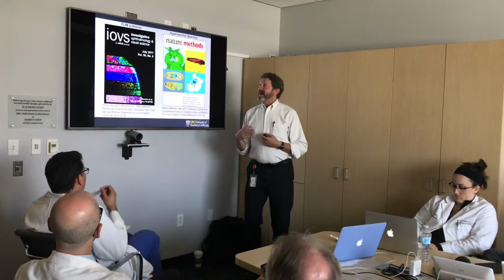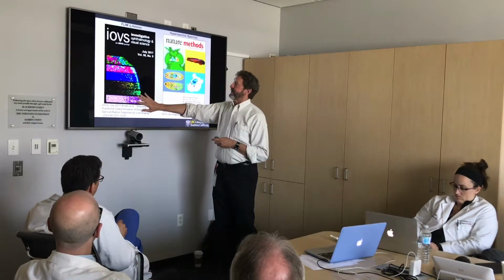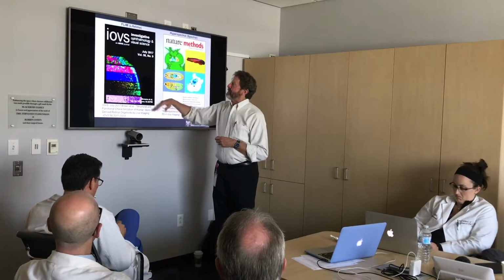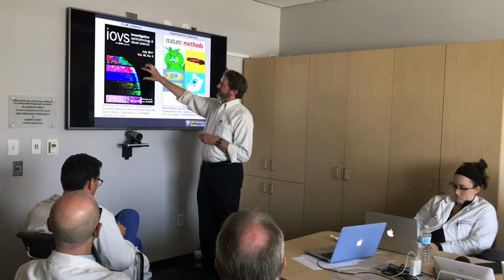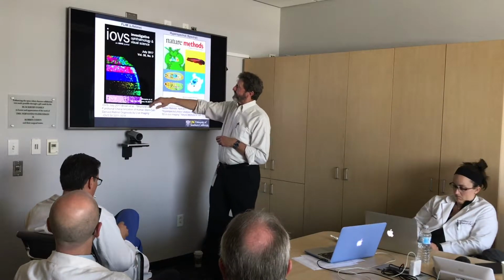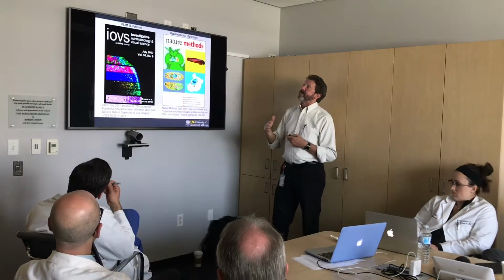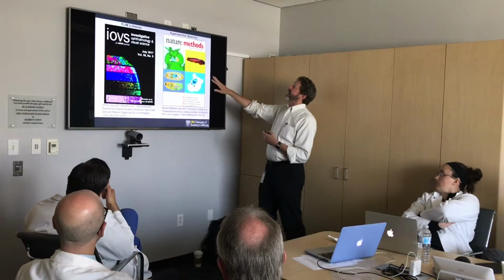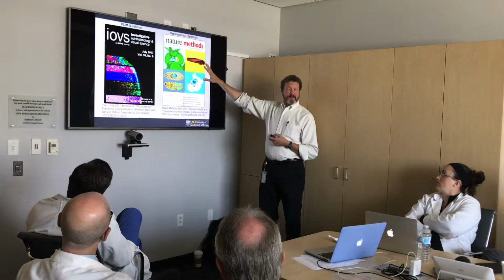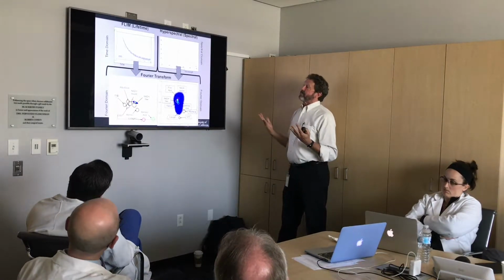So where we are right now is we have one person in the lab, Mimo, who is an Enrico Gratton alumnus, who thinks the entire world is lifetime. But he admits that as well as lifetime imaging, there's hyperspectral imaging for the RNAs, for example. There's a number of different modalities. So he's now willing to consider multimodal imaging, even though he knows the whole world centers on lifetime. His former lab mate is also in the lab, Francesco Cutrale. He believes the entire world is hyperspectral. And so we have negotiated a truce, and the truce is let's do both.